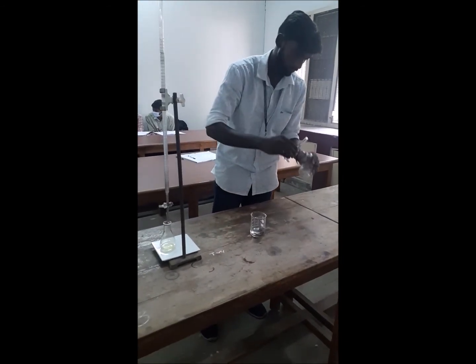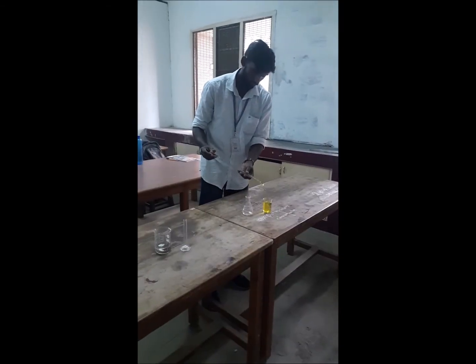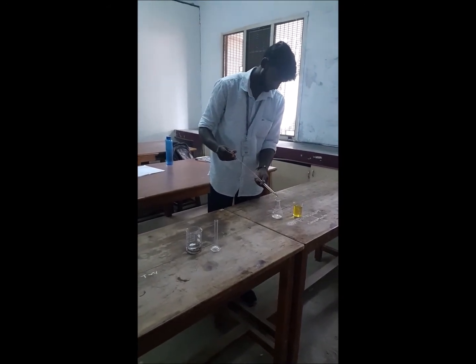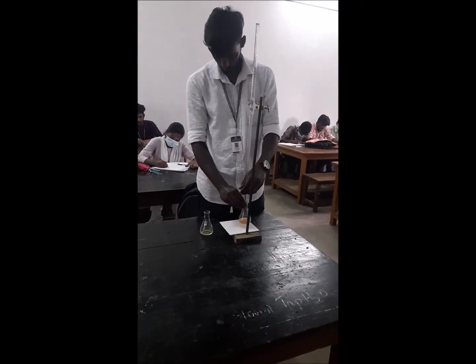that is taken in a conical flask. After that, add potassium chromate, that is 2 to 5 drops of potassium chromate indicator solution. So the solution turns yellow in color. Then titrate with the silver nitrate solution taken in the burette.